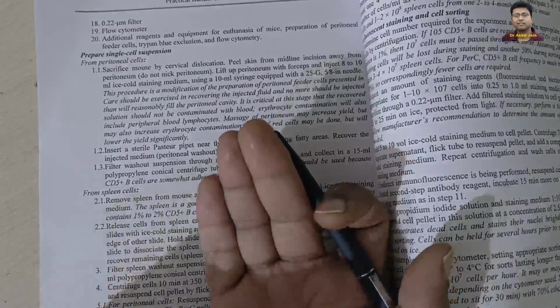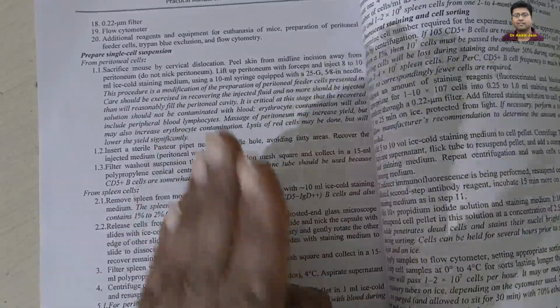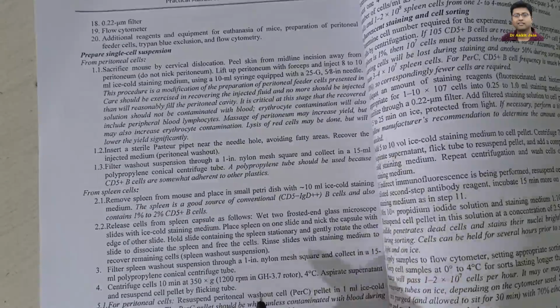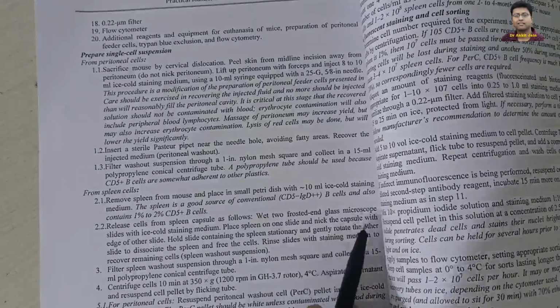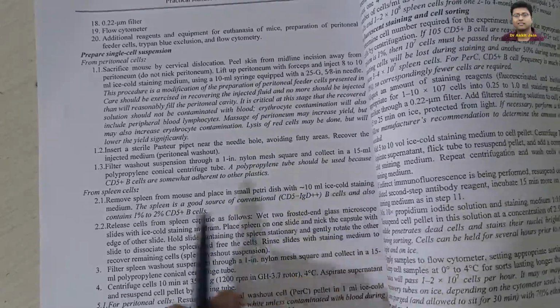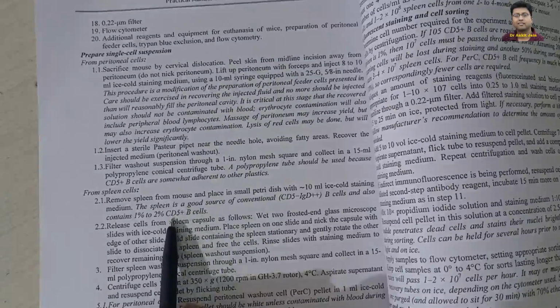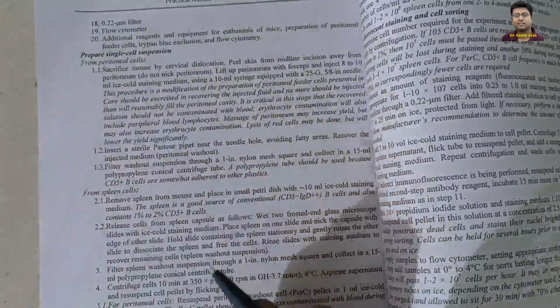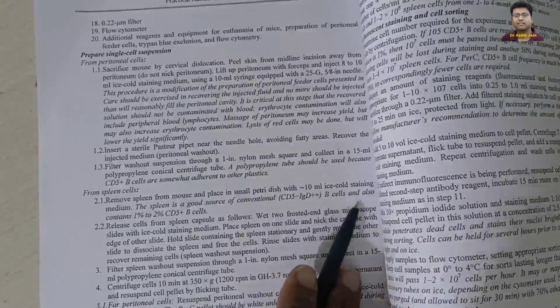from the spleen cell. So after removal of that capsule, we have to gently rub the surfaces of spleen, but before the rubbing, we have to put it into the ice cold staining medium. This ice cold staining medium is used to recover the B CD5 positive cells. So after gentle rubbing, we have some cells in suspension of ice cold staining medium.